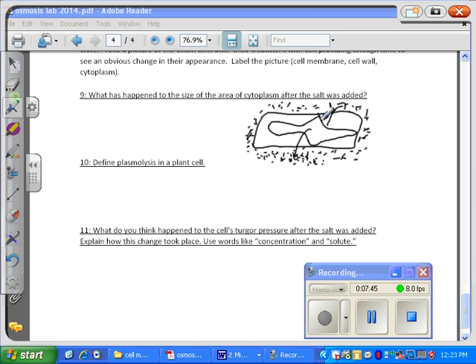And so the black line that I'm drawing now is the cell membrane. The line that's out here is the cell wall. And the cytoplasm is all the stuff that's in here. It looks a little bit brighter and a little bit more concentrated, but you can see all this white space, and that's all it is, just space. So when the cell membrane comes in like this, we call it plasmolysis. So the plasma membrane has lysed or broken away from the cell wall.